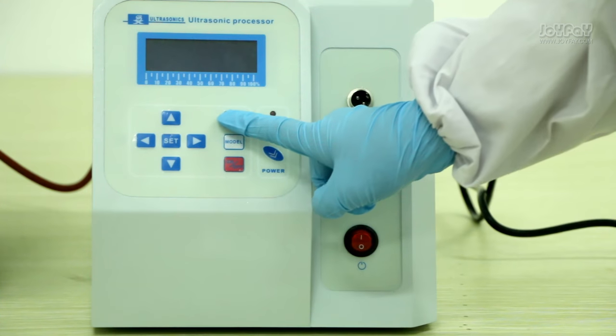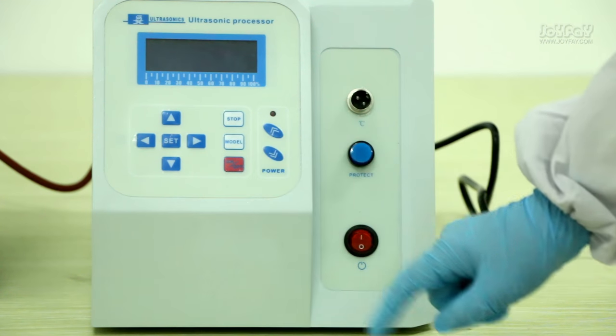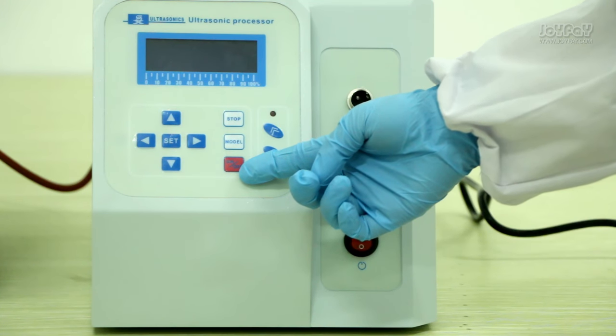Press the stop button and the machine will stop working. Press the model button and you can change the mode of the machine or make the machine continue to work. You can turn on or turn off the machine by pressing the on or off button.